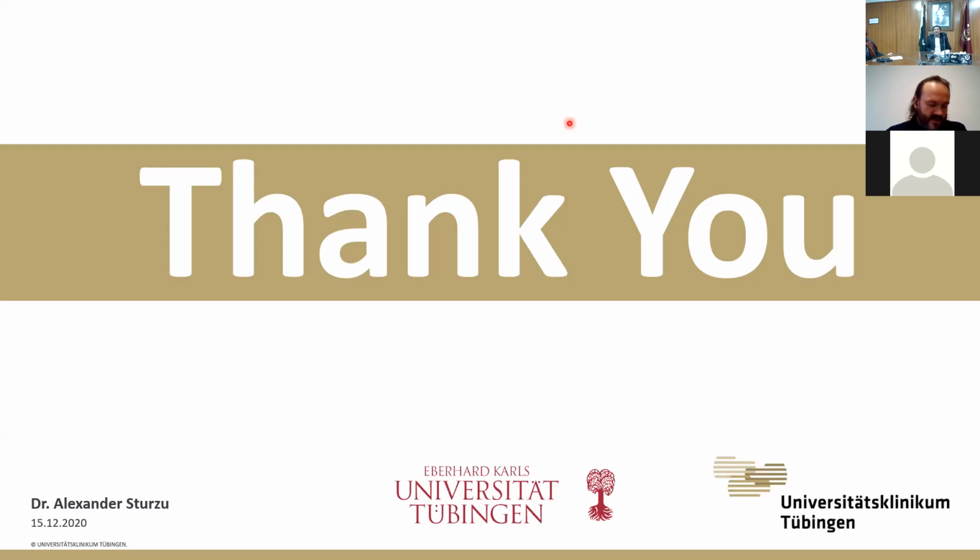I'm sorry, I have no experience in this case because, I don't know how much in the introduction you got to know about my work. I am designing these novel agents. Like I showed you one picture in the analysis part where I designed a specific ligand for a receptor that we found to be overexpressed in prostate cells. In this way, we are designing these ligands and labeling them for imaging, and then we evaluate them on the cell culture. So in this way, we're always doing direct measurements. We're not measuring any changes in the cell culture. We're measuring the direct effects.